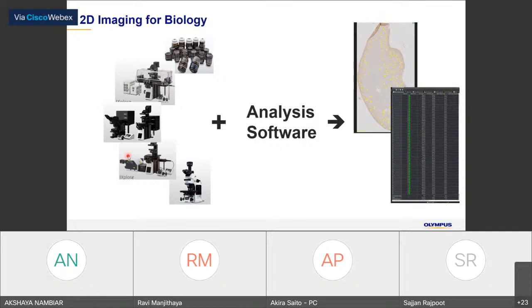But anyway, today's topic is about the analysis, so I'll touch on this. And the final goal is that we find the region of interest. Sometimes I will say objects that you are focusing on, and get the information from that object.